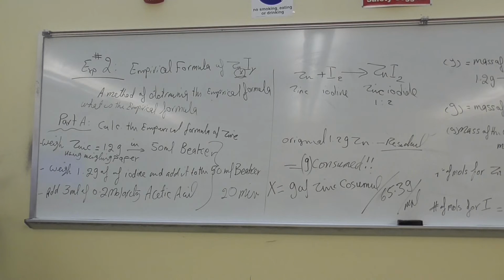Okay? Now, the heating is going to take about an hour. You have to adjust your timing, yes. An hour, for the acetic acid solution to be evaporated, yes. It's going to take some time. And then you have to also adjust your clock on 20 minutes after you mix them together, the chemicals.